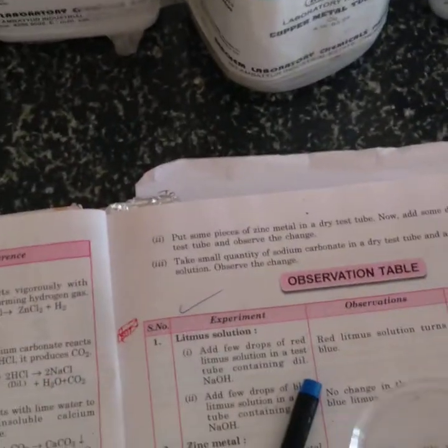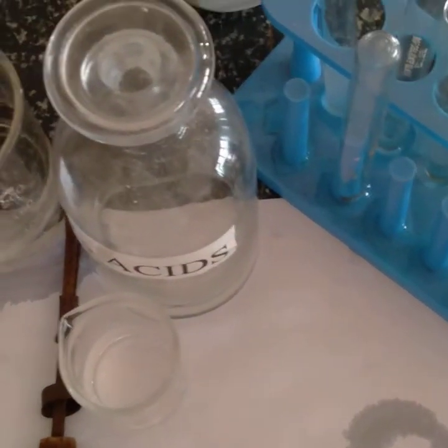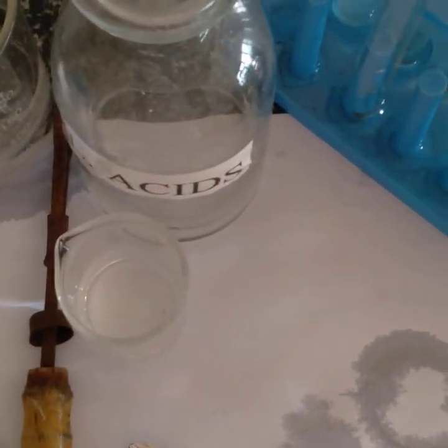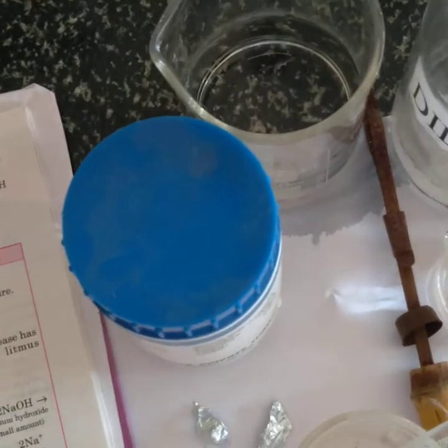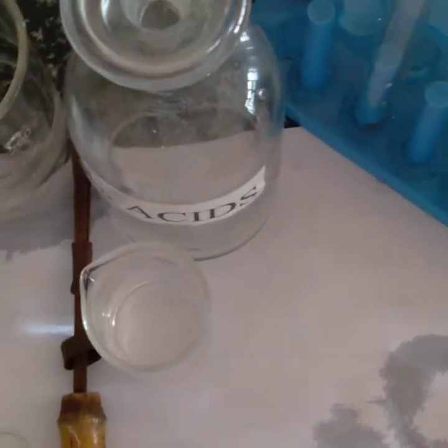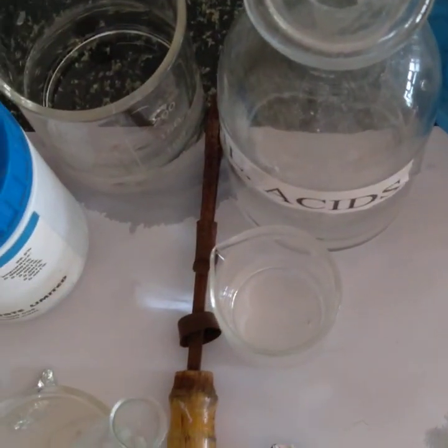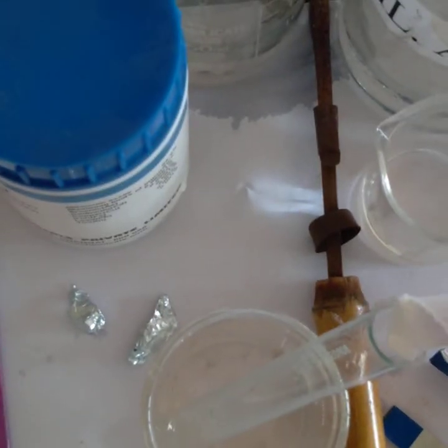I am going to take sodium carbonate into the test tube. See, I am going to add a pinch of sodium carbonate.